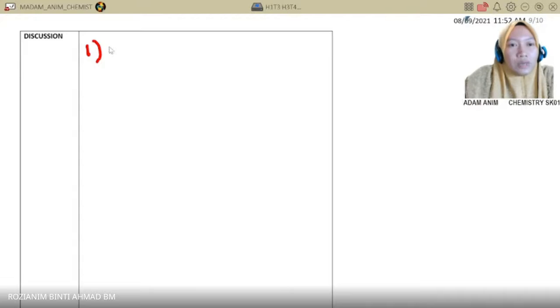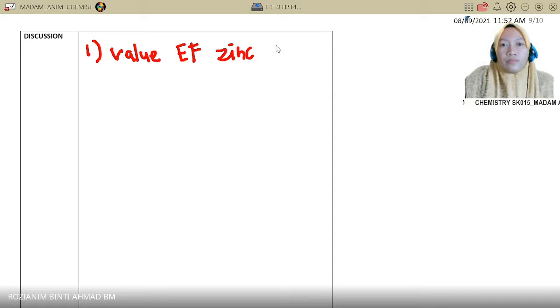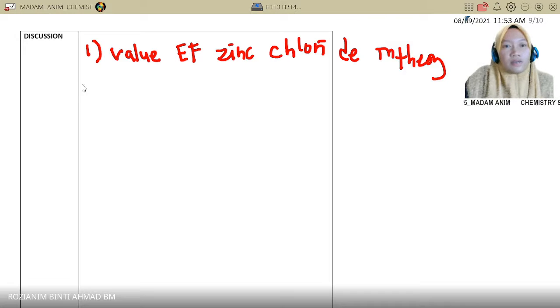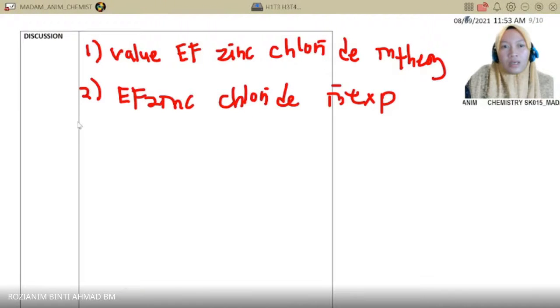Okay, saya nak you tulis what is the empirical formula value. Okay, empirical formula zinc chloride in theory. Okay, and then for the second, you must state the empirical formula zinc chloride in experiment. Okay, and then ketiga, you must compare.